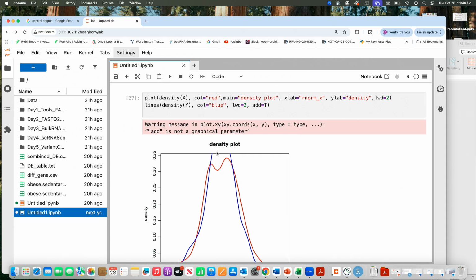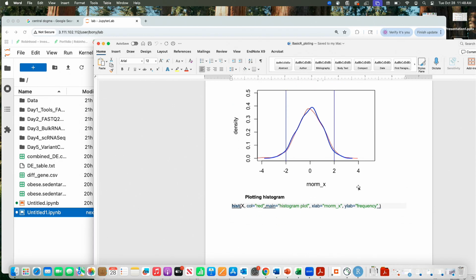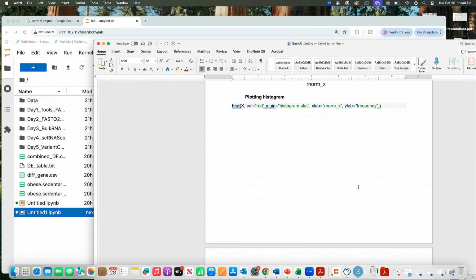There are two ways to deal with this situation. One is you flip the data, you plot y first and then x later on, so that the maximum value is taken by y. Or you use the xlim and ylim functions and then plot it. And you can use abline and all those things there. Everybody could make a histogram and merge them together? Can do that? Fine. All are experts now in R plotting.